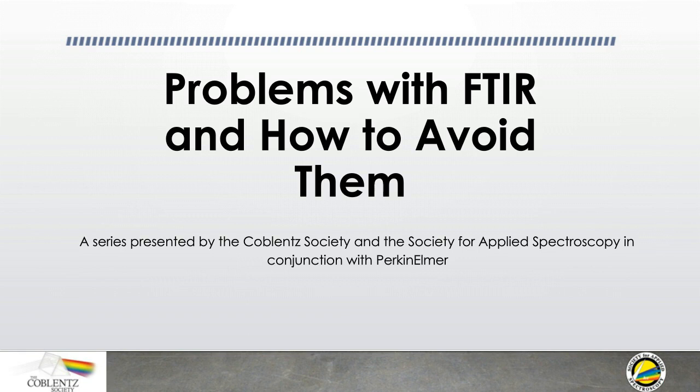We're here today to kick off a four-part virtual workshop series on FTIR analysis in partnership with the Society for Applied Spectroscopy. We will meet every Thursday at this time throughout the month of October to learn about various facets involved in FTIR analysis and interpretation. Broadly, our topics will cover elements on instrumentation and instrument-related issues, understand the principles of ATR technique, as well as cover some other sampling accessories. Finally, we will also take a deep dive on sample prep and data handling problems in our final lecture.